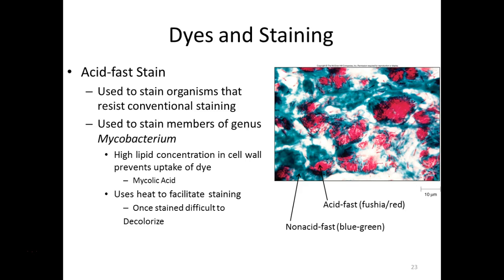So they would be colorless, you wouldn't see them. But we want to know if something doesn't stain acid-fast, so we need to stain it again so we can visualize it. So we'll use an additional stain, what's called a counterstain. And methylene blue, some other contrasting color. Other procedures call for a brilliant green color. They don't actually look very bright usually.